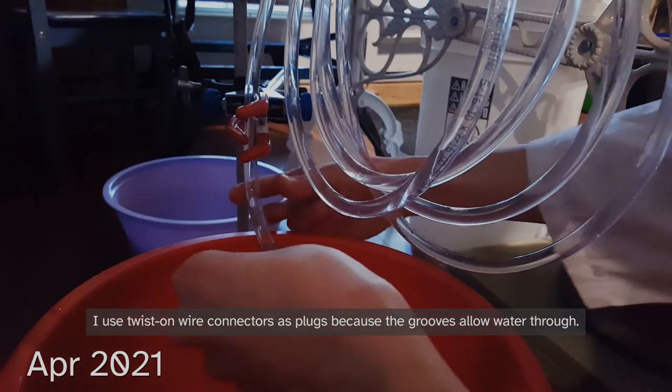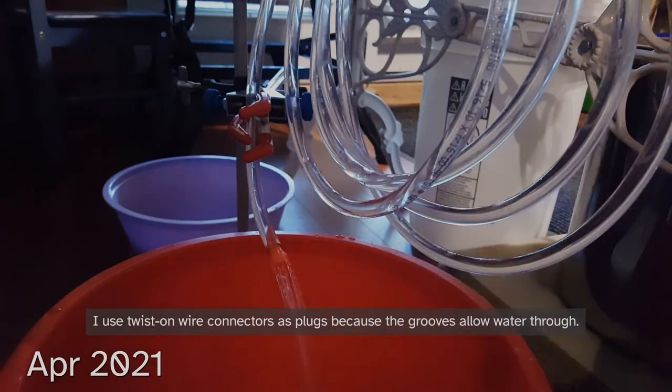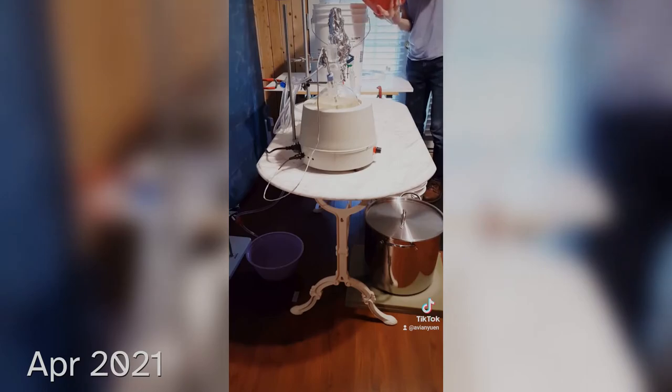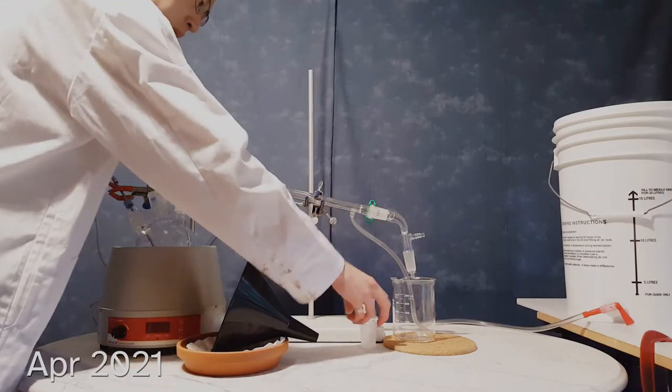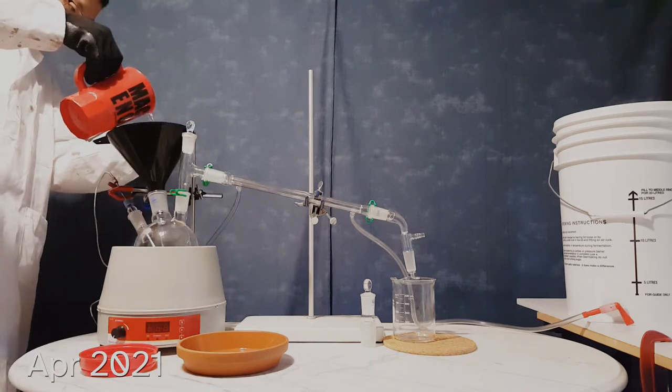Using a leaky plug, I adjust the flow rate to about half a liter of cooling water per minute. When the bottom bucket is full, I manually do the recycle, about once every 20 minutes. On the boiler side, I charge the round bottom flask a bit past halfway with spring water by first running it through a coffee filter in a funnel to catch any outdoor debris.